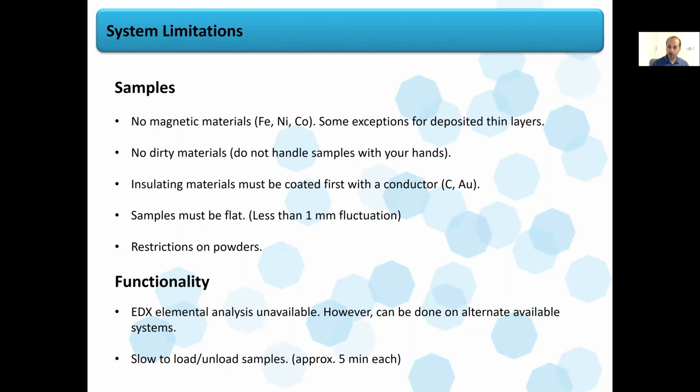Lastly, if you're familiar with other SEMs on campus, it's very quick to load and unload your samples for doing quick checks. This system has a much longer load and unload time. So we're typically doing longer sessions with this system, typically at least an hour. So if you just are looking for quick turnaround work, like I just need to inspect a wafer I just processed, other systems may be more compatible with your needs.